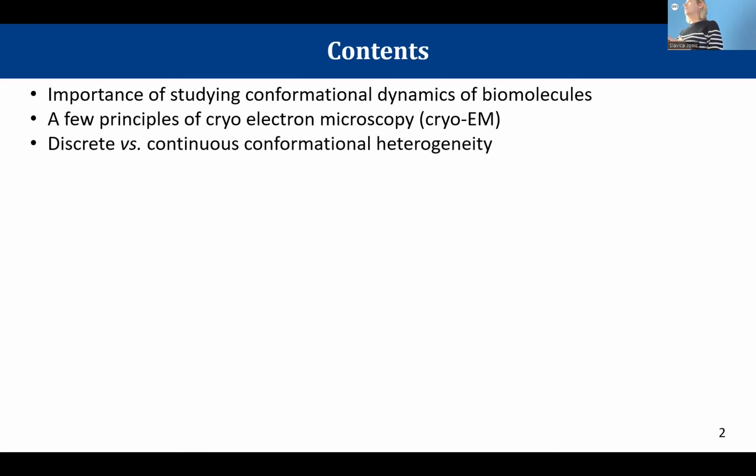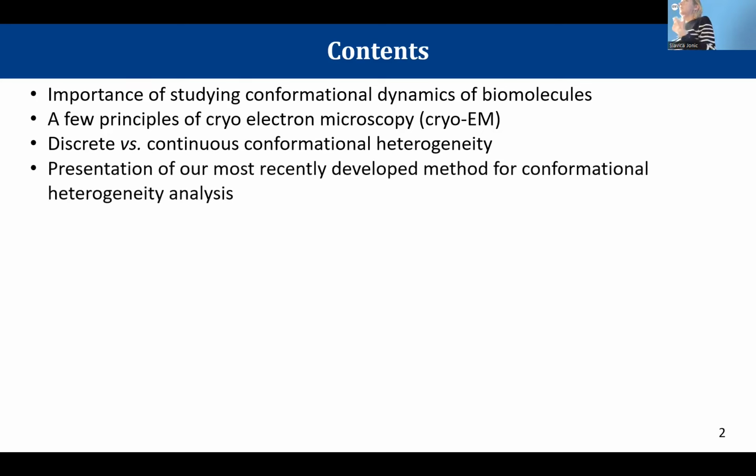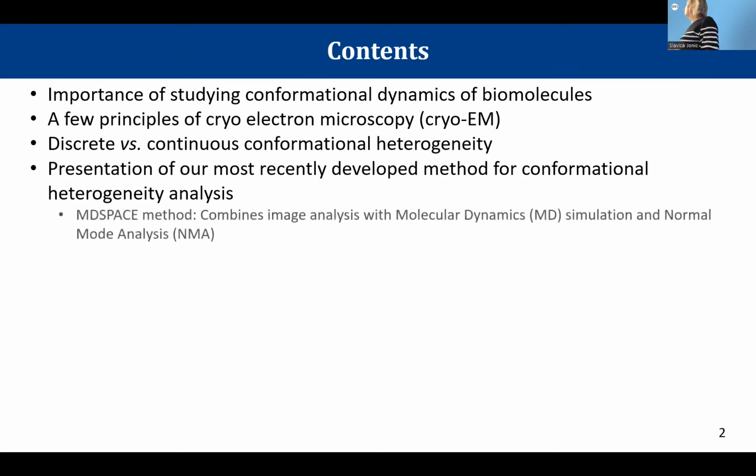Then I will present what we call continuous conformational heterogeneity of biomolecular complexes, with respect to discrete. Then I will present our most recently developed method for conformational heterogeneity analysis, called MD-SPACE, which combines molecular dynamics simulation, normal mode analysis, and image analysis.